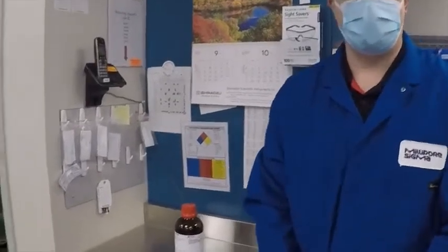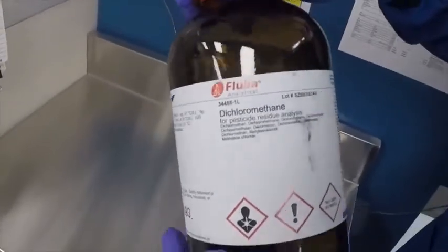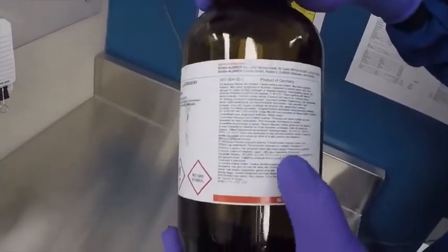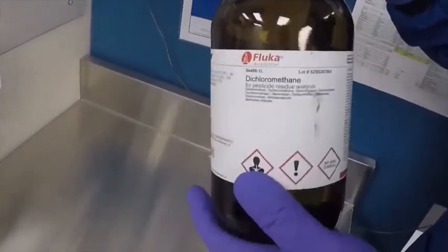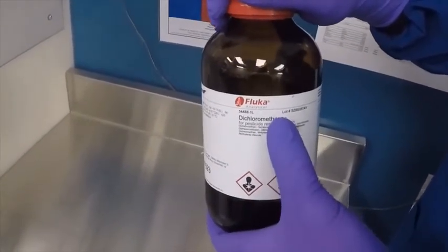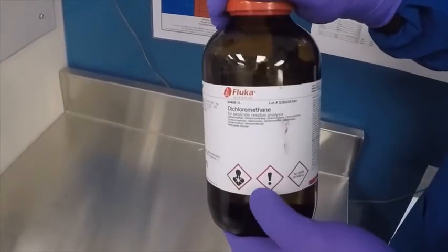Now I'd like to talk about proper chemical labeling. All materials in your lab have to be labeled with the GHS labels. GHS stands for the Global Harmonization System, and it is the only approved system for proper chemical labeling available today. On a GHS label you'll find the proper chemical name, the proper chemical symbols, the proper CAS number, and some specific information about your chemical. This all comes from the SDS — the safety data sheet — which is aligned to that chemical, so check your safety data sheet and everything will match.